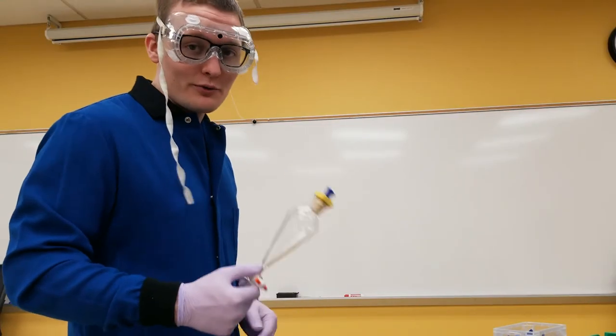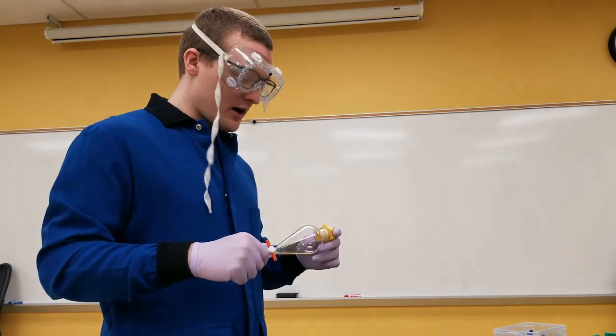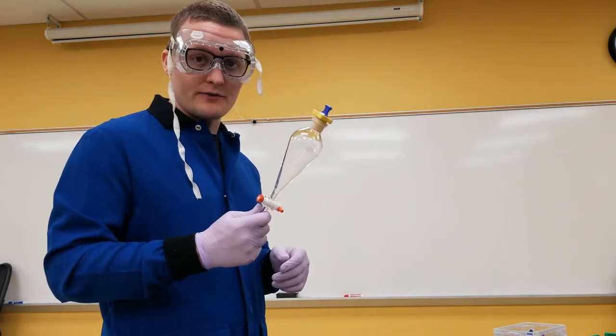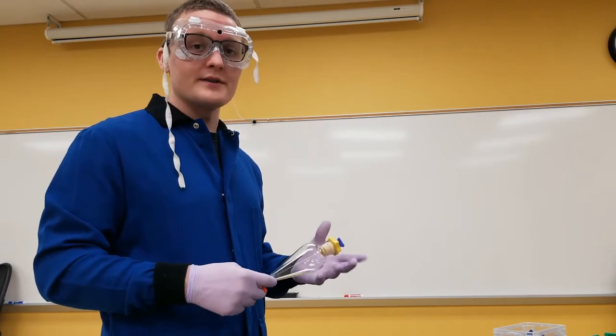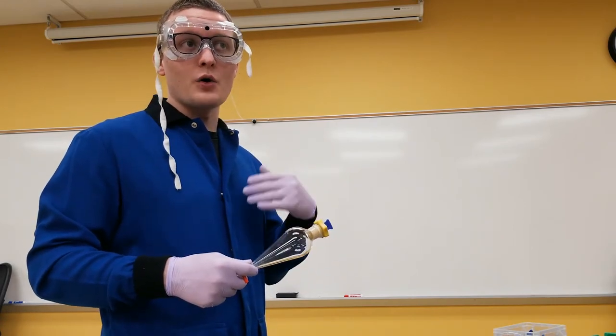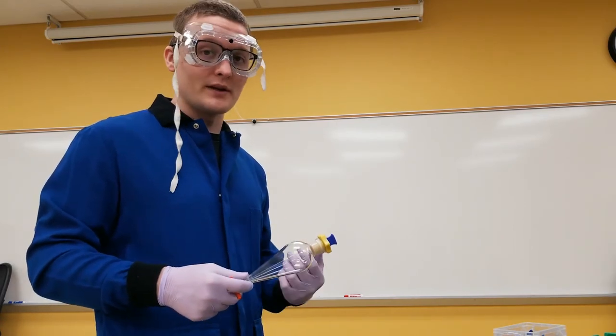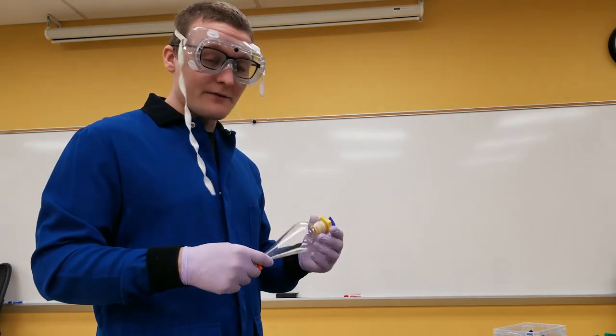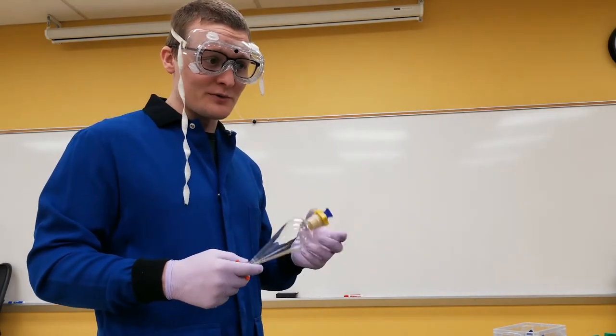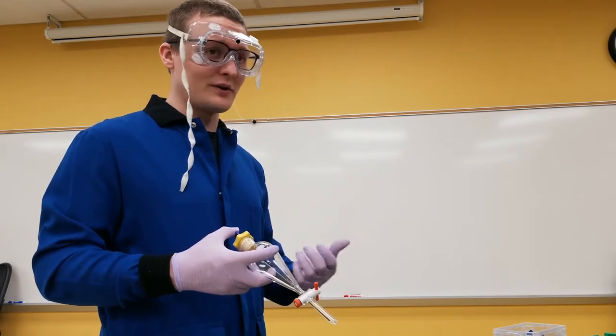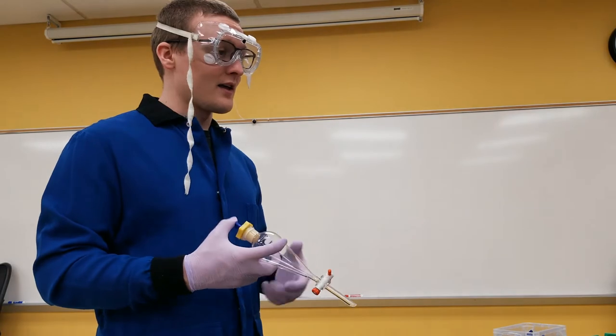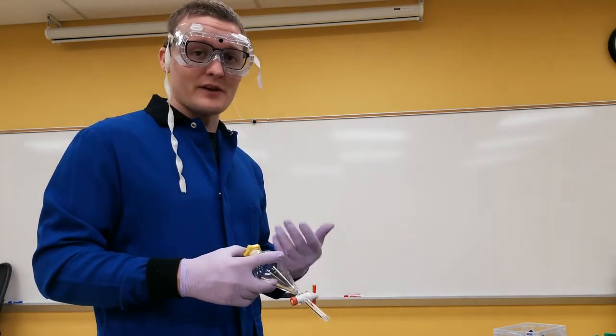Hi everyone. Before we get into isolating caffeine, I'm going to talk about separatory funnels. We use them a lot in this class to separate components with different organic and aqueous solubilities. The first thing I'm going to show you is actually the motion by which you use it, because it can be done specifically to make sure you don't spill on yourself, and you do so in the most safe way possible.